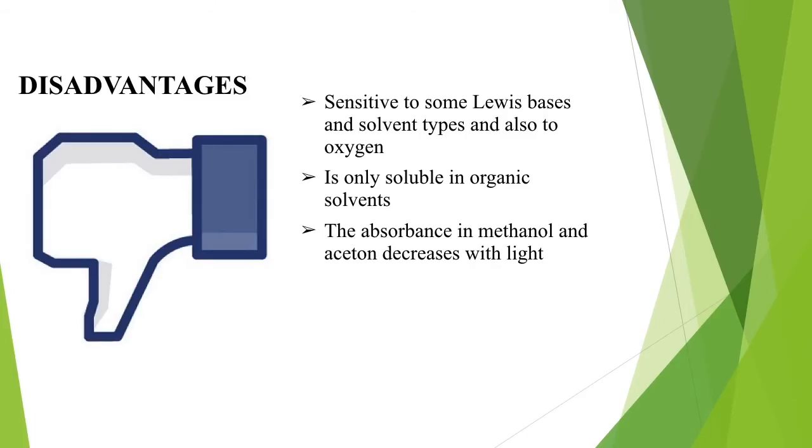Some of the disadvantages are it is sensitive to some Lewis bases and solvent types and also to oxygen. It is only soluble in organic solvents. The absorbance of DPPH assay in methanol and acetone decreases with light.